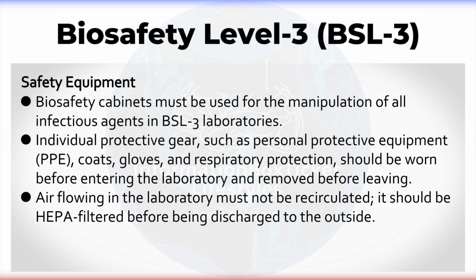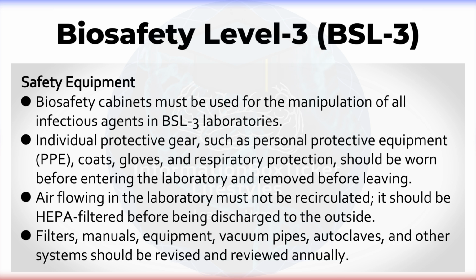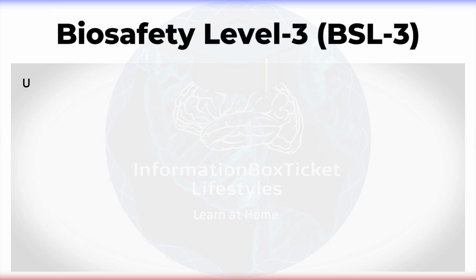Air flowing in the laboratory must not be recirculated. It should be HEPA filtered before being discharged to the outside. Filters, manuals, equipment, vacuum pipes, autoclaves, and other systems should be revised and reviewed annually.